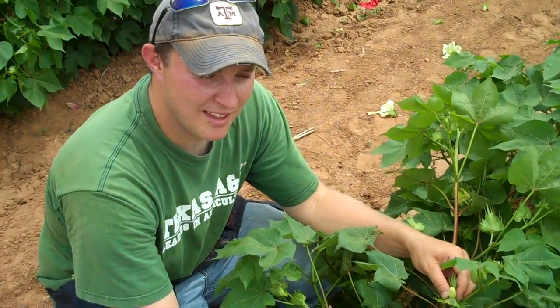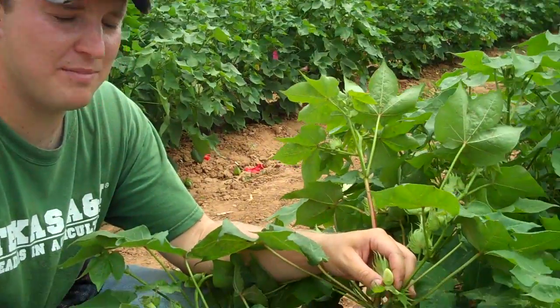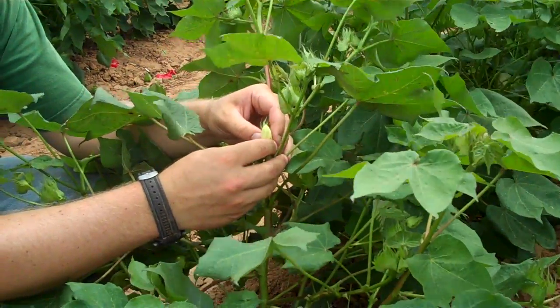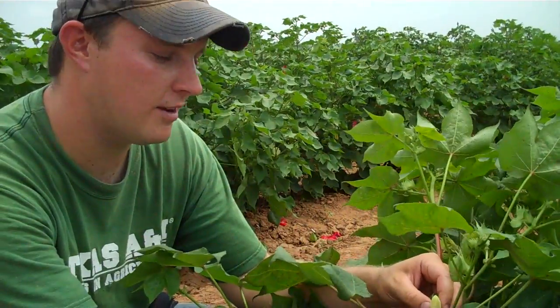These are some cultivars from Africa that we're looking at for further genes for fiber length, and we're going to be crossing this with a couple testers — one being Texas A&M Extra Long Staple Upland variety, another being also a Texas A&M Short Staple variety.